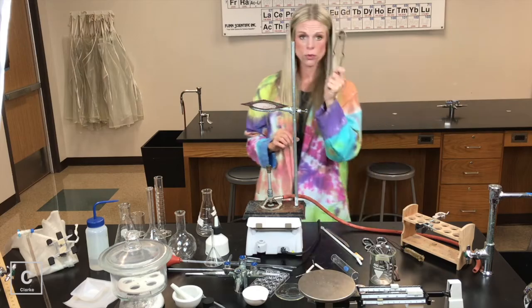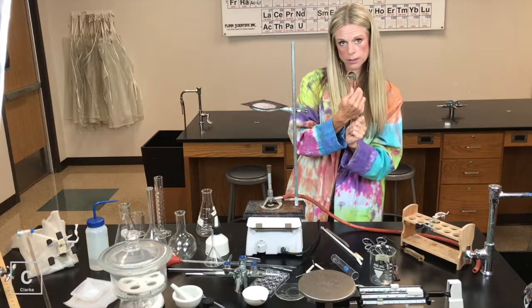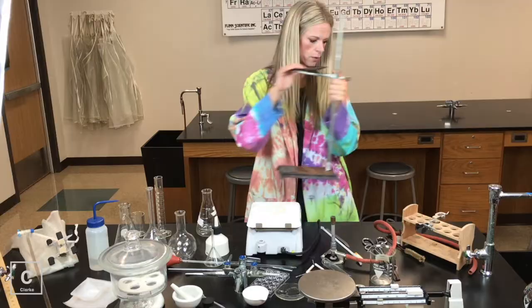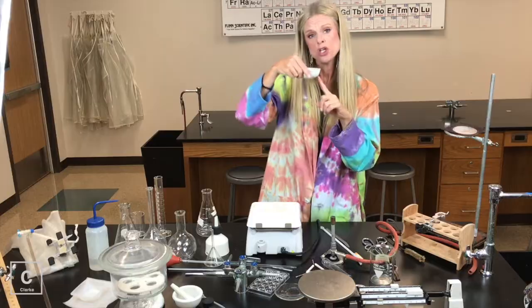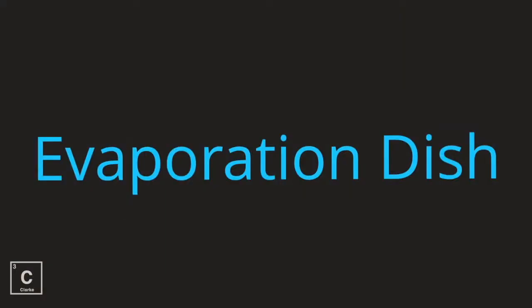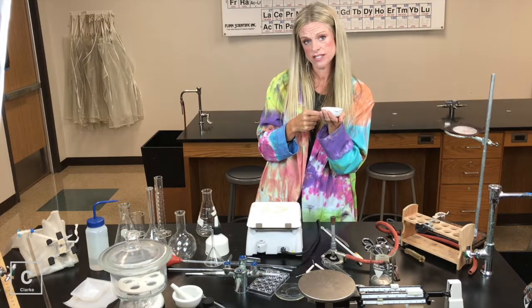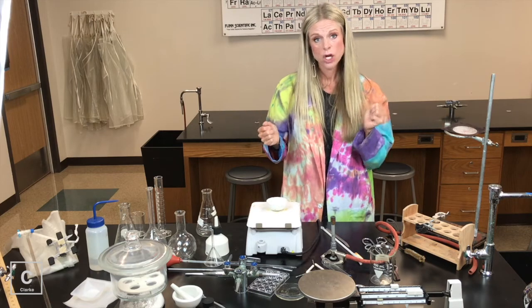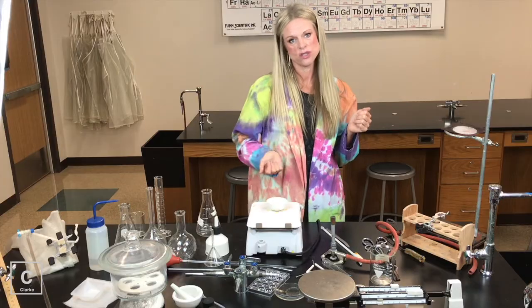When we're lighting our Bunsen burner, we would need a striker. We're going to make that spark and light our Bunsen burner. When we need to use our hot plate to evaporate things, we would need an evaporating dish. Lab equipment that gets put into high heat is going to be ceramic — we've got a ceramic evaporating dish so it can take very high heat. We use an evaporating dish to separate a solid from a liquid by evaporating, using a hot plate or our ring stand and Bunsen burner setup.